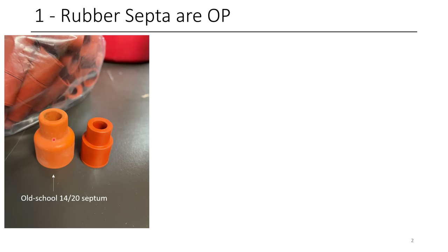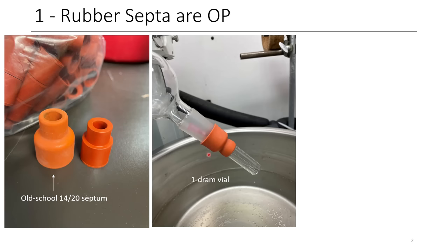Now the cool thing about these older ones is they're basically more valuable than gold. You can attach them onto a one dram vial like this, where you put the 14/20 part around the outer part of the vial where the cap would go. And then you stick a needle in.